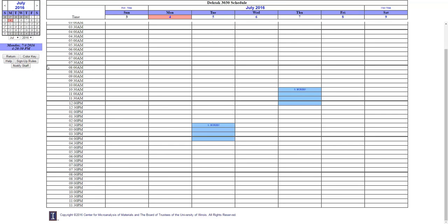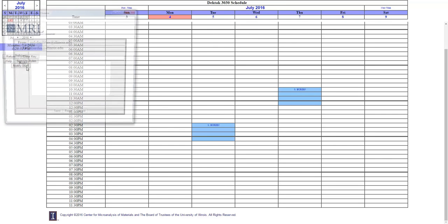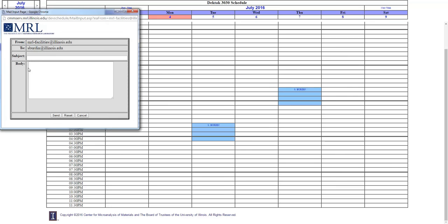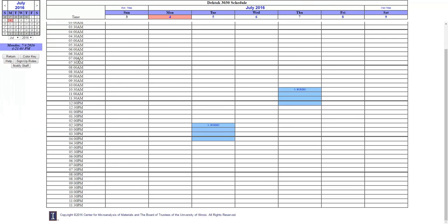You may also click the notify staff button if you observe a problem with the instrument, or if the instrument area is a mess, or something that you think the staff should be made aware of. You can just find out the staff email by clicking the notify staff button, and do this directly from the schedule system.